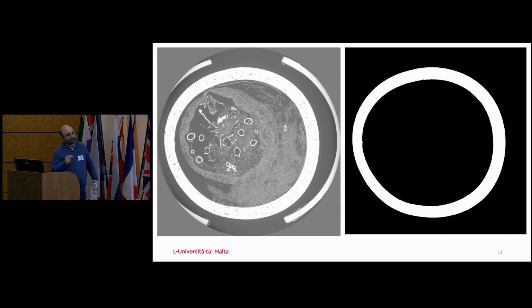And rather than having to label each one of those 4,500 slices, we would instead like to have a sample of slices that a human would label manually, and then the computer would infer from that information how to generalize over the unlabeled slices. So basically, instead of having to label 4,500 slices, you just label 6, and then the rest is done automatically, right? And that would be great.